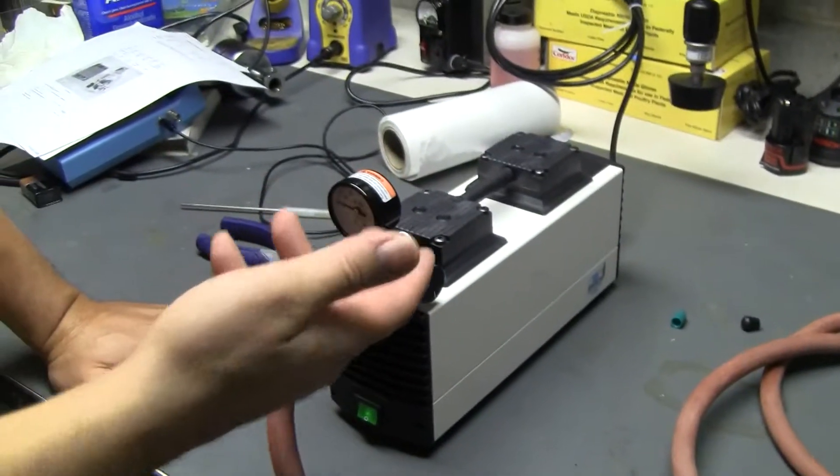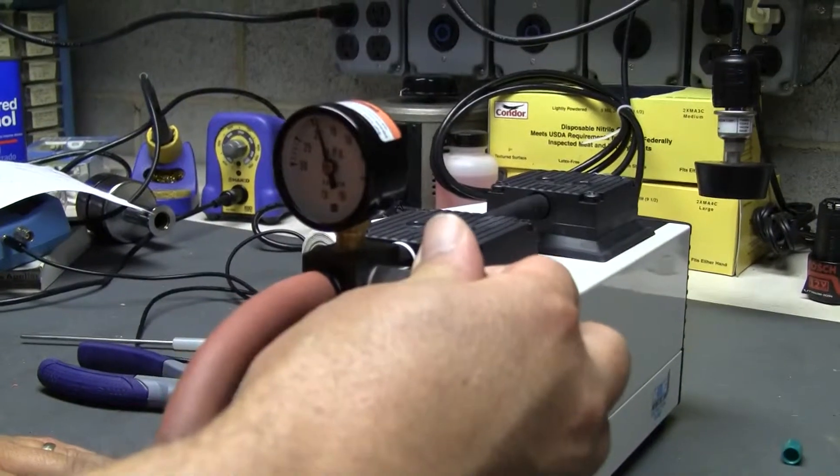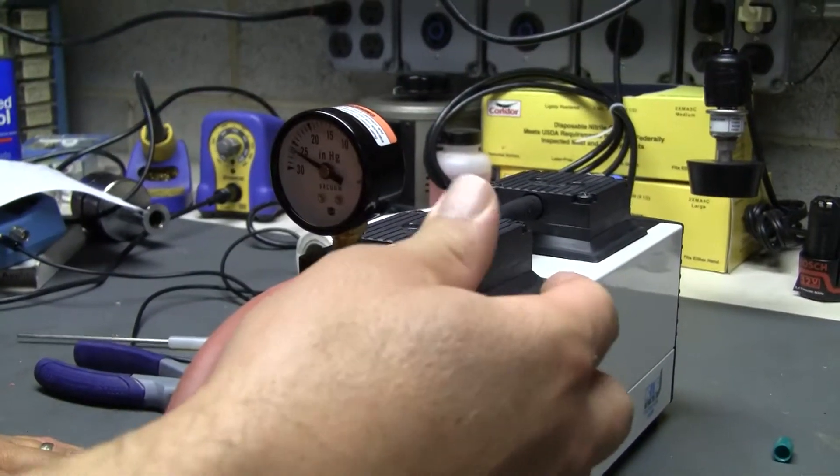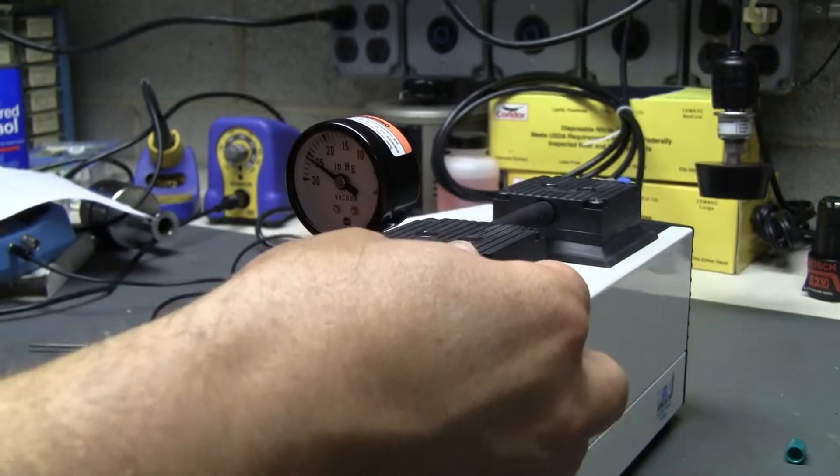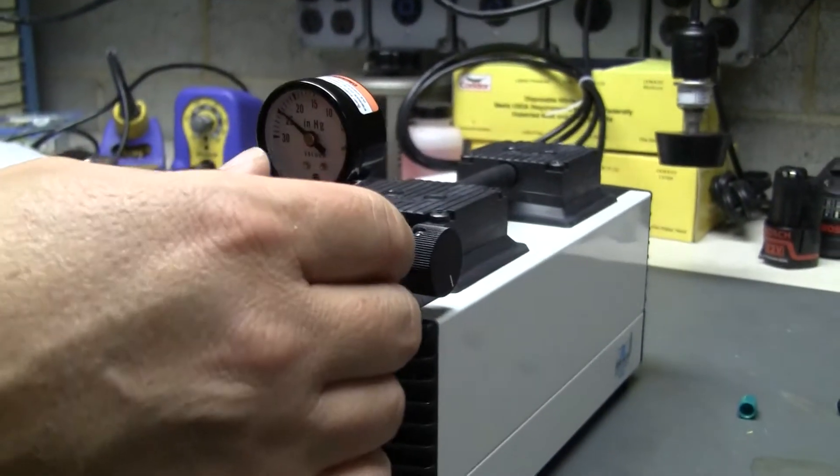So, what's nice about this particular model, it's got this little gauge, which if you wanted to control the vacuum a little bit manually, you can. It'll ballpark it for you, which is really nice.